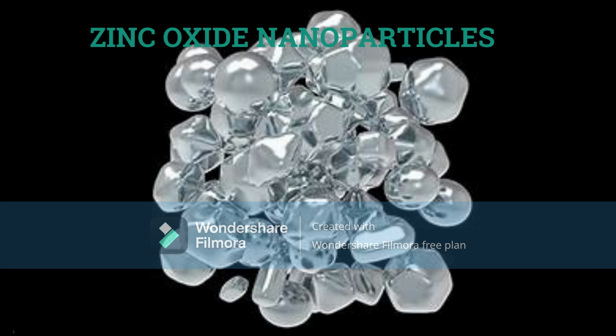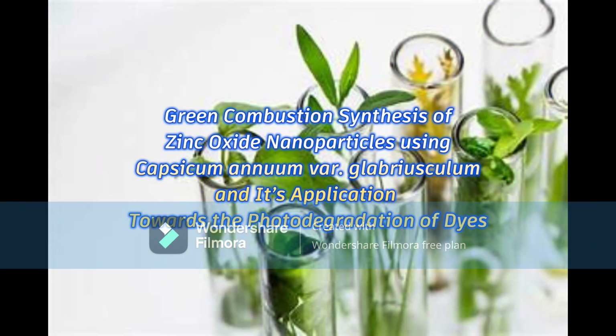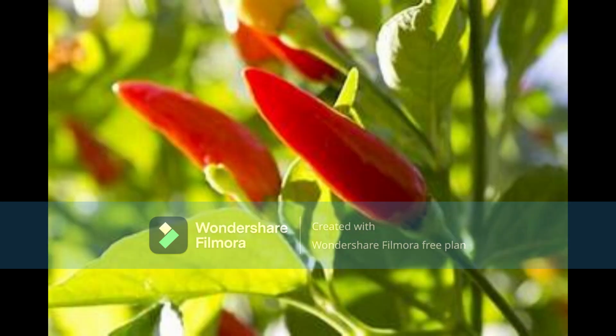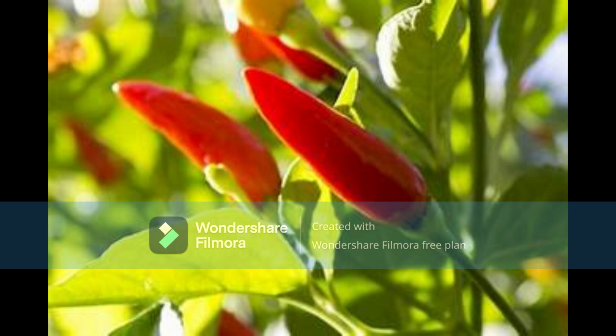Zinc oxide nanoparticles are particles with dimensions between 1 to 100 nanometers and are widely used in various fields. This research is about green combustion synthesis of zinc oxide nanoparticles using Capsicum annuum var. glabriusculum and its applications toward the photodegradation of dyes. The plant that will be used is Capsicum annuum var. glabriusculum, also known as bird peppers.